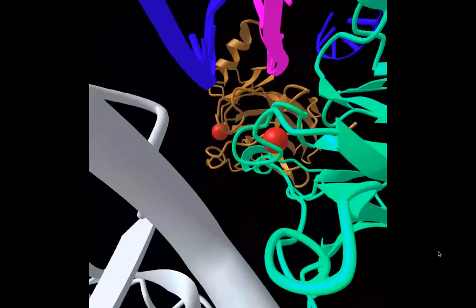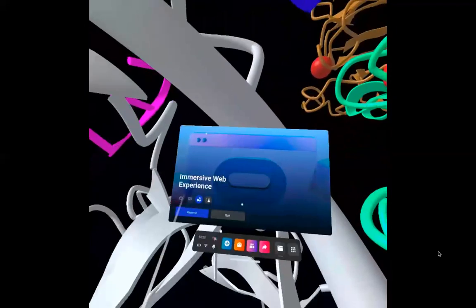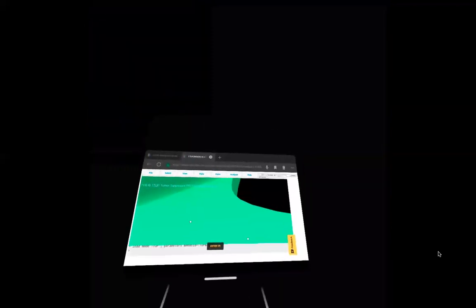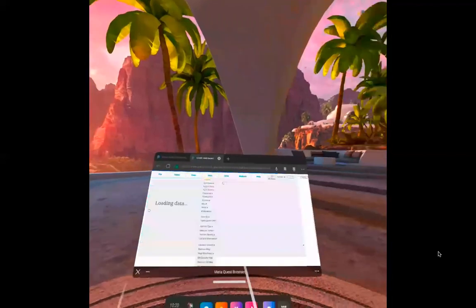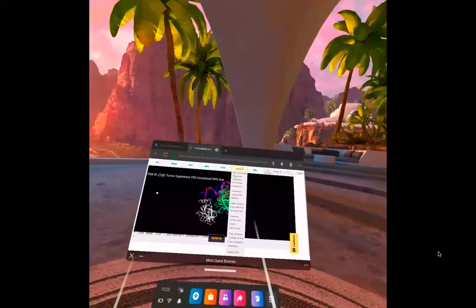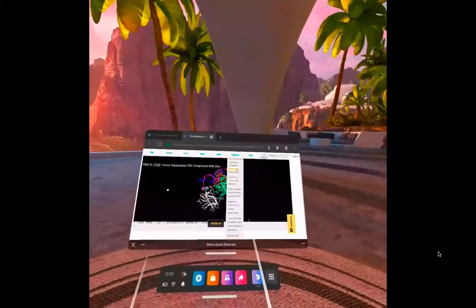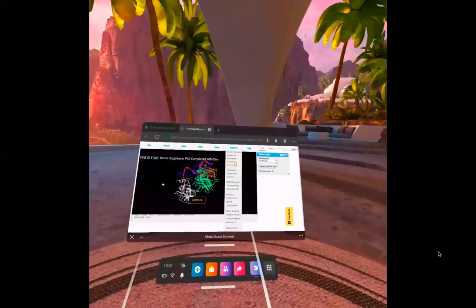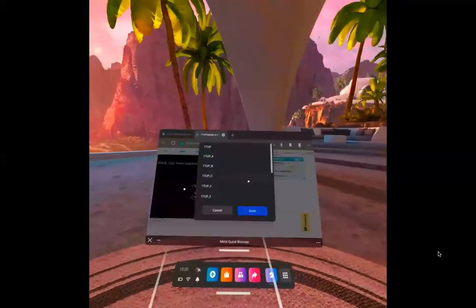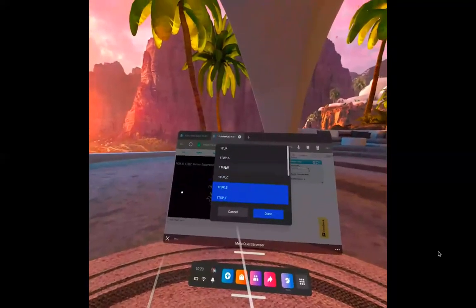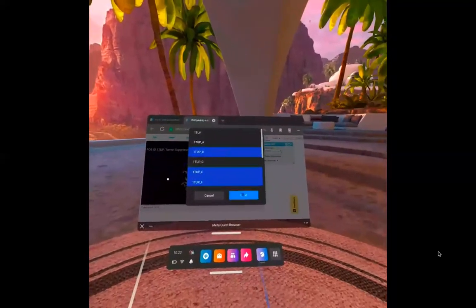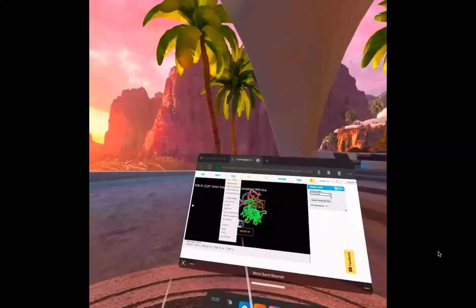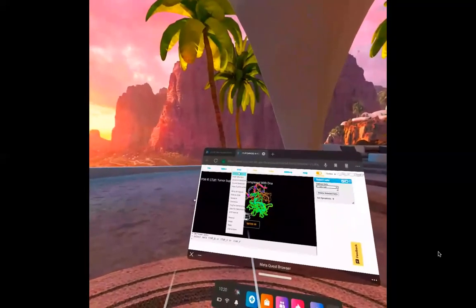So you can click on this button to exit, and you can show a subset. Here I just simply use define set, show two nucleotides, one of the protein chain, and they are selected, and you go to view selection.